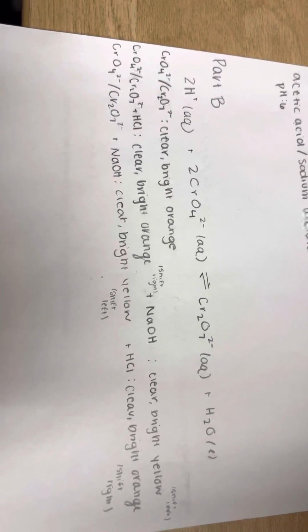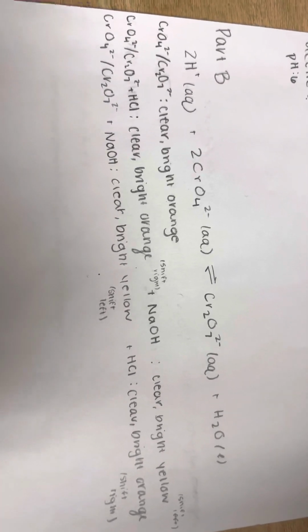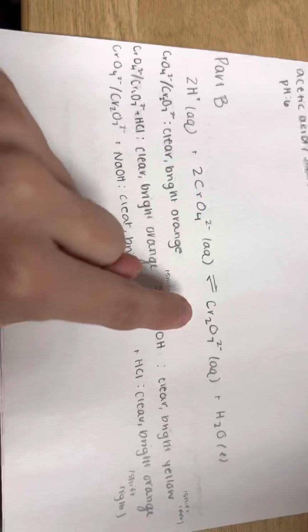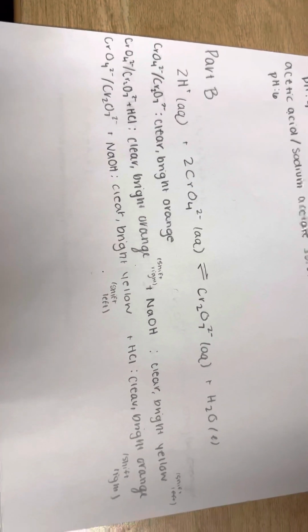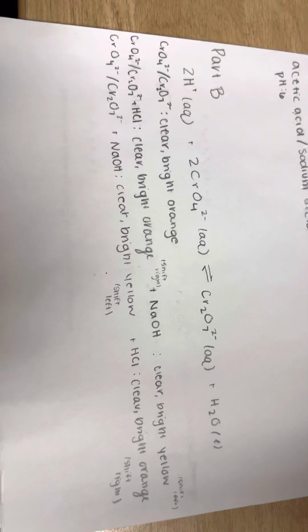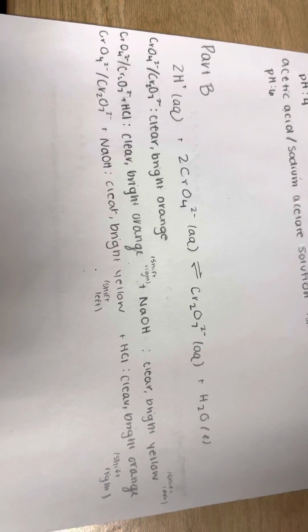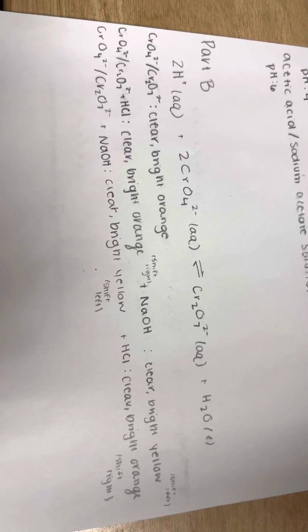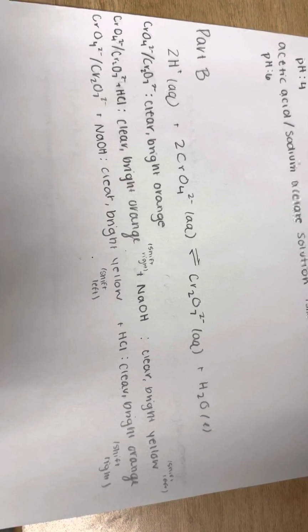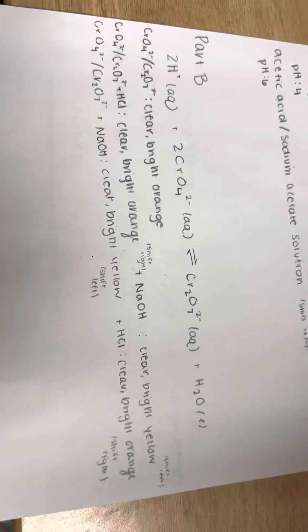The original solution has the color that it does because it is more acidic and it is containing the Cr2O7 2- ions, which again is an orange color. And then just to recap, every time an acid was added, it would shift back to the right to the clear bright orange color, and every time that a base was added, it would shift towards the left, which was a more clear bright yellow color. Thank you.